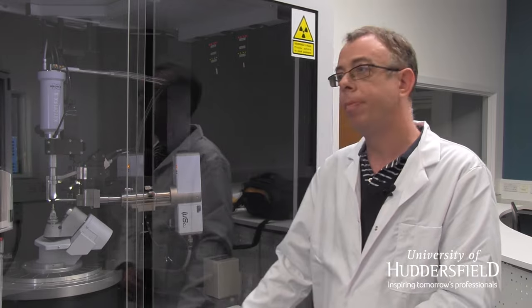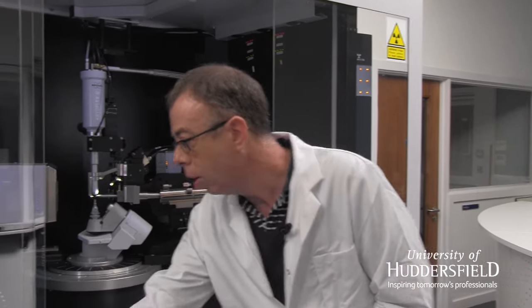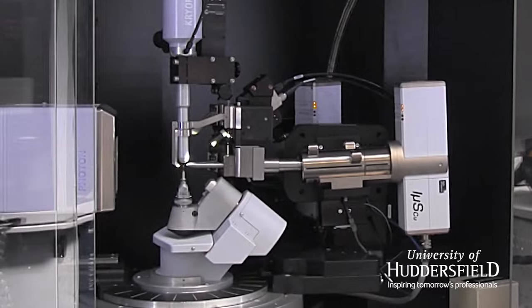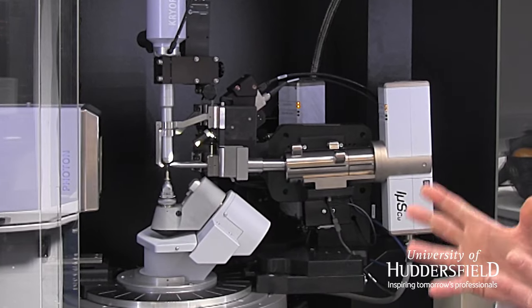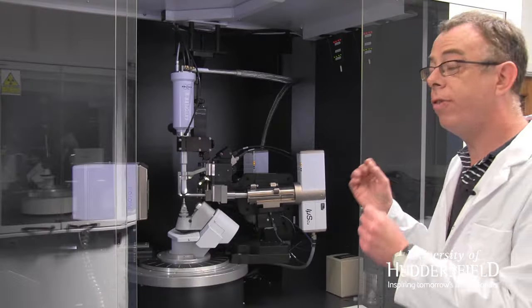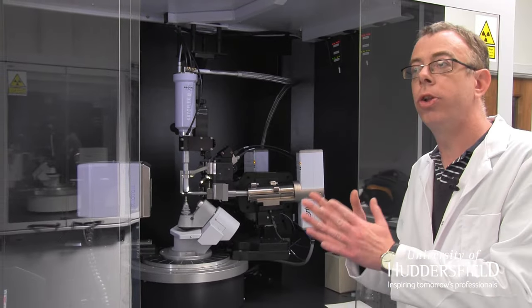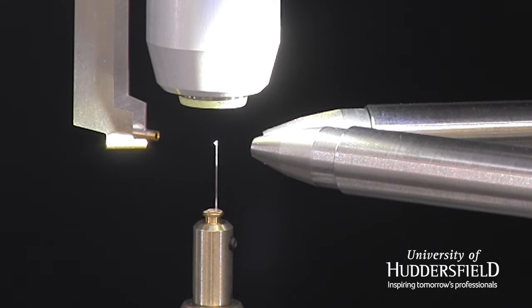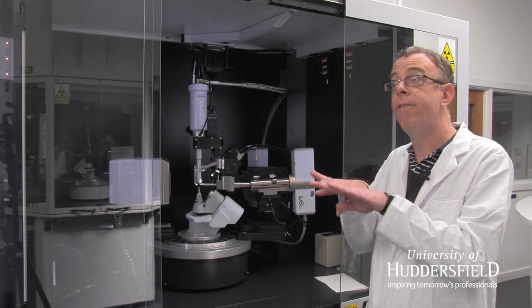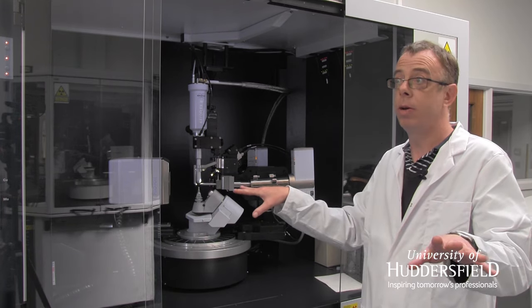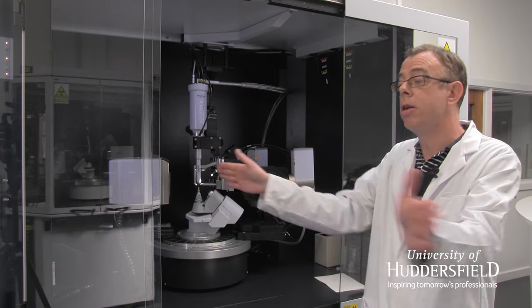Inside here we have lots of instrumentation, but at the end of the day what this does is it just looks at crystals. When you have a crystal, a crystal is a uniform piece of matter. Everything is arranged equally. When you expose that piece of matter to X-ray beams, they diffract. So it takes the X-rays and out they pop.